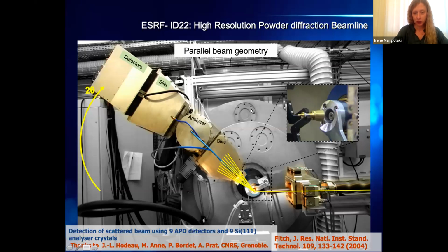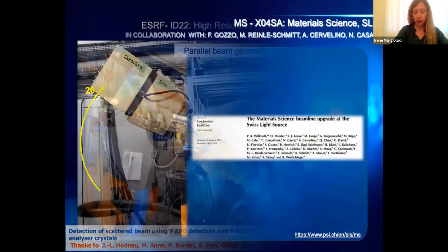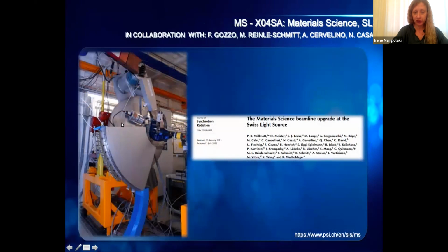In fact, we use this instrument quite a lot, and also this instrument at the Swiss Light Source, which is the same. However, the detector here is called Mythen. It was produced by the detection group at the Swiss Light Source. And the power of this detector is that it's something between a point detector and an area detector, so it's very, very fast. And now that I heard from Jean Susini about the Eiger detector, which will be installed at ID22, I'm very, very hopeful that this axis of data collection will be implemented on ID22 as well.